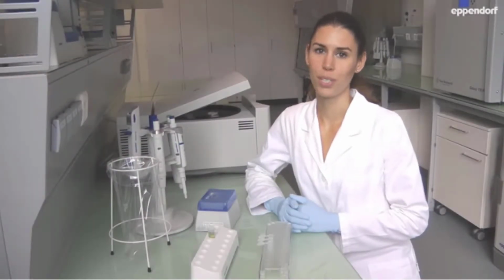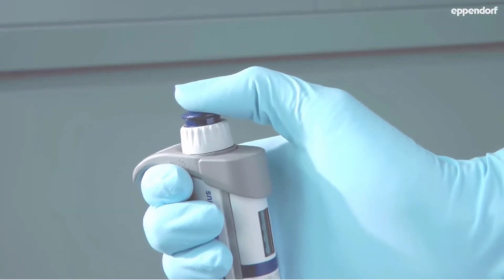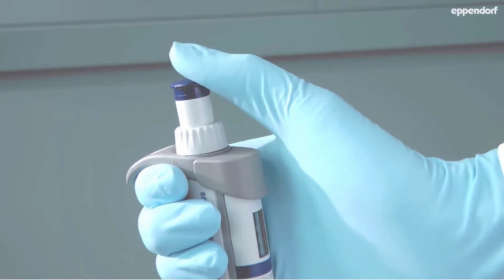Welcome to the pipetting tutorial How to Pipette Correctly. I'm using a 2-button pipette. It has a control button with 2 stops and an ejector button.